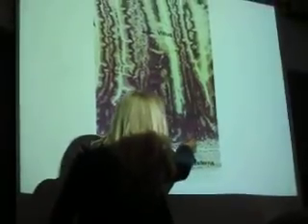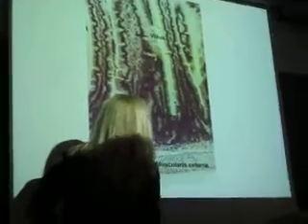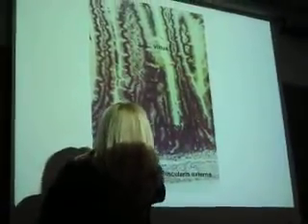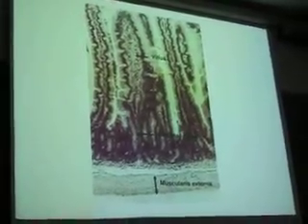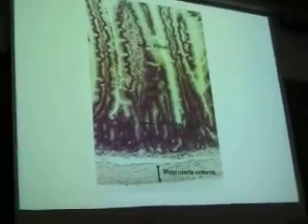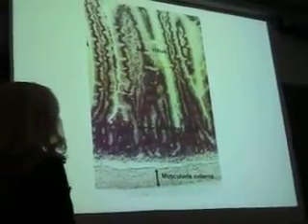At the base of these villi, we're going to see these invaginations. Okay, there's a portion of one there. Here's a pretty good one that shows you its actual connection to the epithelium itself, but there are several indicated up here. These are intestinal crypts. And at the intestinal crypts, digestive enzymes are going to be secreted onto the mucosa. Okay.